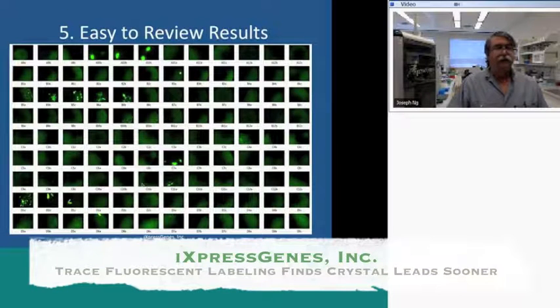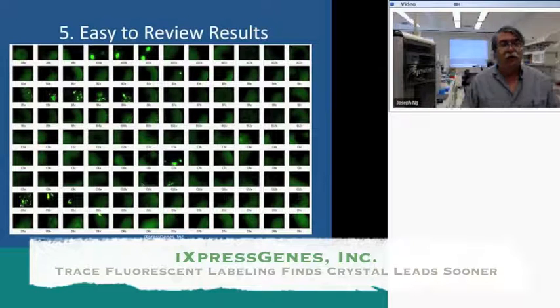Here is an optimistic or a very happy outcome where we're looking at the images from a screen, and we can see that, again, with intensity equaling structure, we can step way back from here, and we can see all the conditions of interest in this. They shine through. They're very easy to see. We can step back even further and see them.